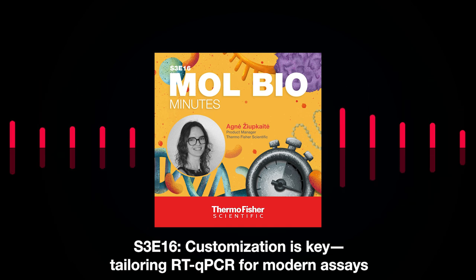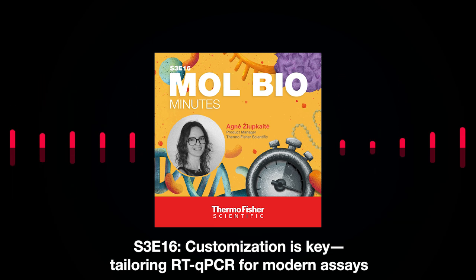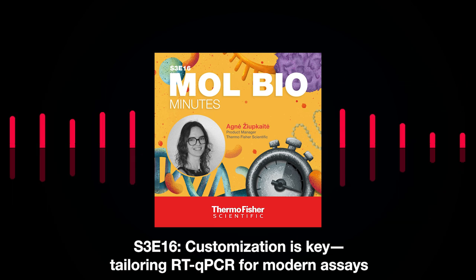These higher-level considerations include reaction efficiency, which impacts the accuracy and reliability of the assay, and which is affected not only by the RNA template, but also by the reverse transcription enzyme.